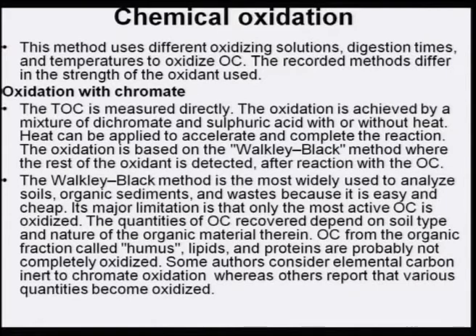The oxidation is based on the Walkley-Black method, where the rest of the oxidant is detected after reaction with the organic carbon. The Walkley-Black method is the most widely used to analyze soils, organic sediments and waste, because it is an easy and cheap method. Its major limitation is that only the most active OC is oxidized. The quantity of OC recovered depends on soil type and the nature of the organic material therein.